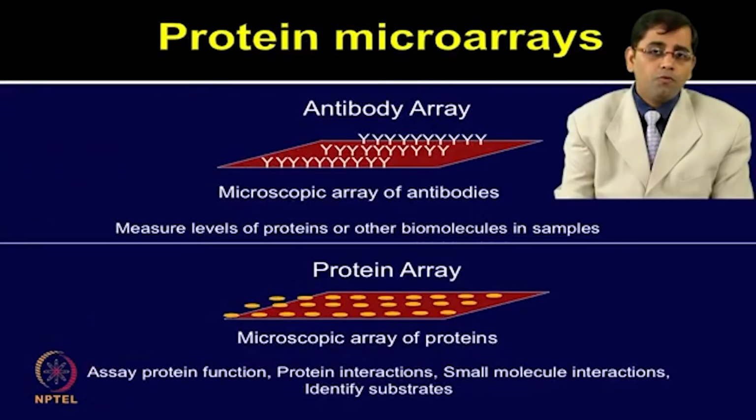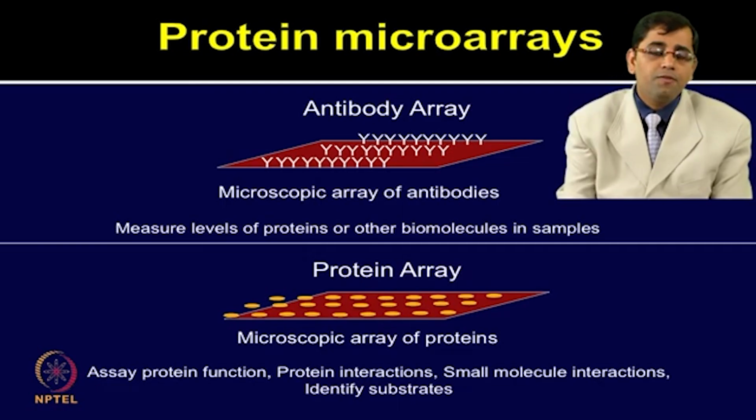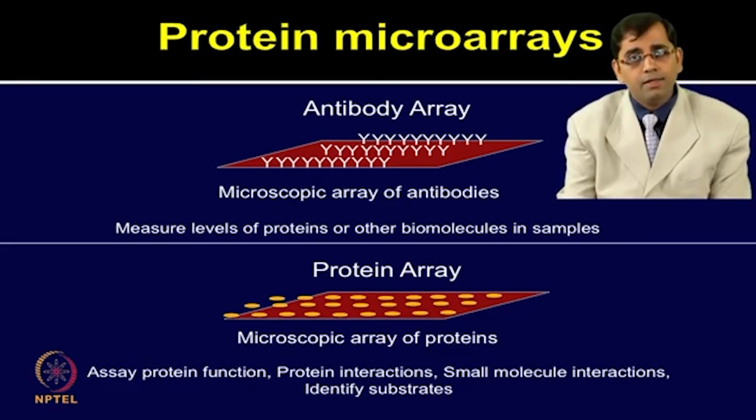Protein microarrays fall into two general broad classes, antibody arrays and test protein arrays. As shown in the slide, the antibody array is an abundance-based method which intends to inform the users or investigators how much of each protein is present in each sample, or to identify the proteins whose abundance is differentially expressed in one sample as compared to another sample.